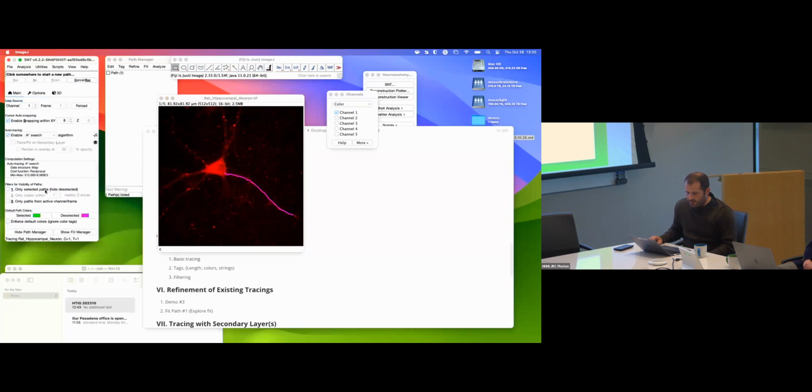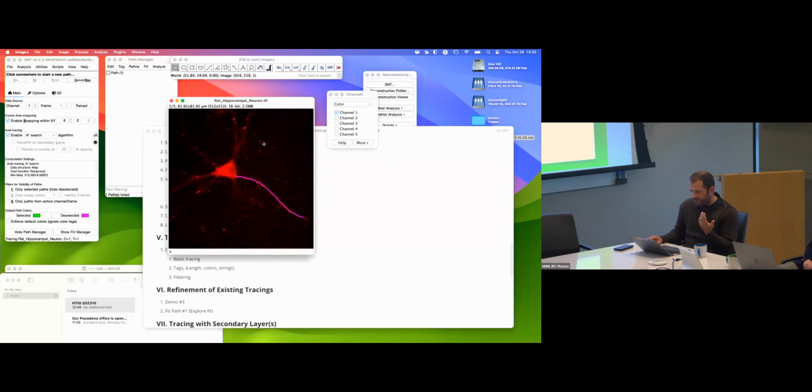You see also here, there is this shortcut I highlighted. If I want to toggle filter number 1, I just press 1 and so on. So that makes it easier to know the shortcuts. Okay, so that's pretty much it.